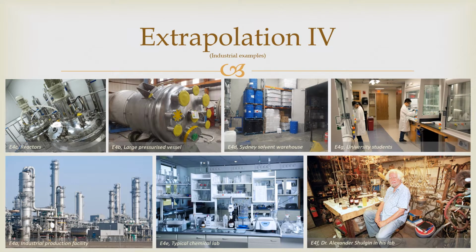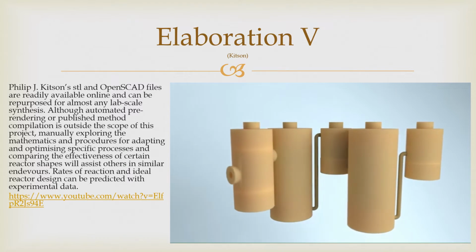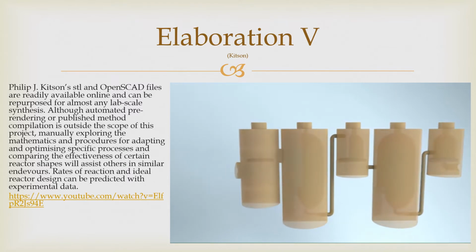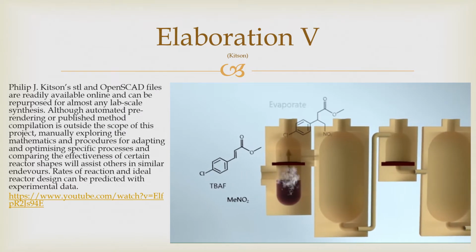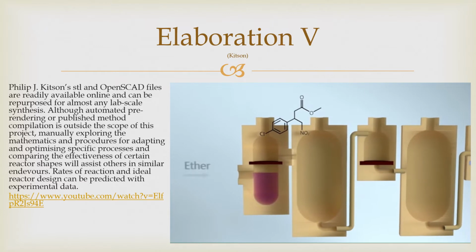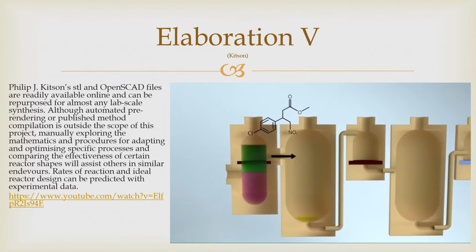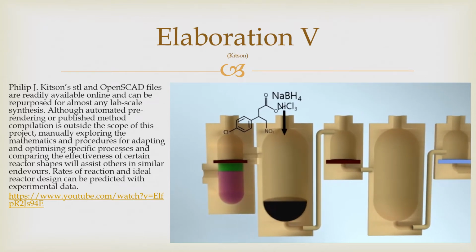Industrial, lab, and microscale chemistry is often practiced in metal, ceramic, and glass vessels, the yield of each process determined by unalterable reactor design. Recently, Leroy Cronin and Philip J. Kitson's groups have pioneered 3D printing vessels for this wide array of chemical reactions to astounding success. The level of control awarded these desktop devices is unparalleled. This could bring seized means of on-site chemical production into high schools, homes, and hospitals.